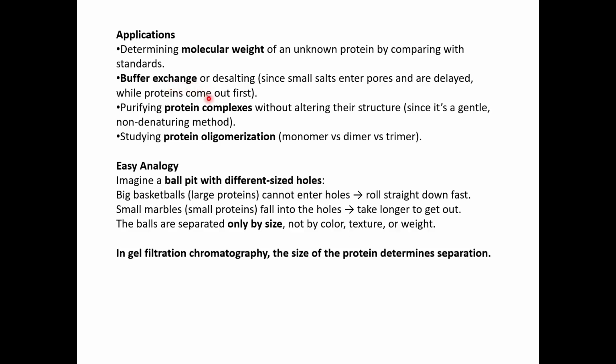Then there is buffer exchange or desalting. Since small salts can enter the pores and will be delayed, while proteins will come out first.